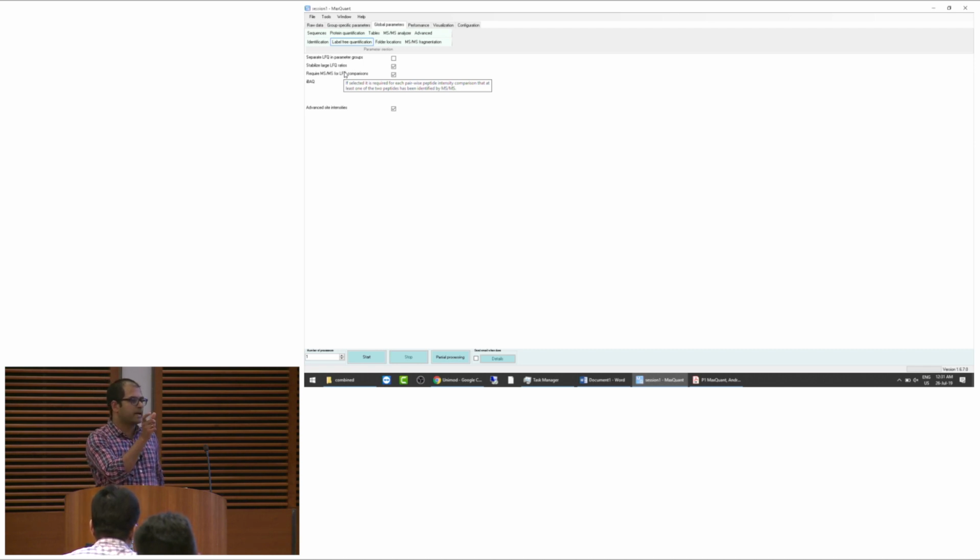It's for each pair, there should be at least one MSMS, when you do the initial pairwise comparison at the very beginning of the LFQ process. So it's not that overall, if there was only one MSMS, you would get LFQ values in many. No, right? But it's exactly in these pairwise comparisons.